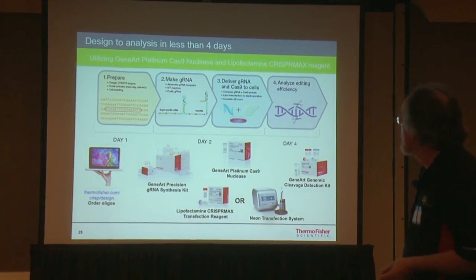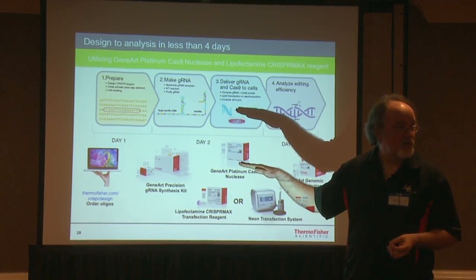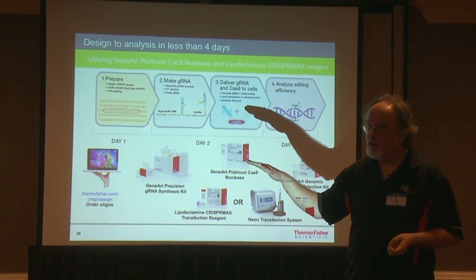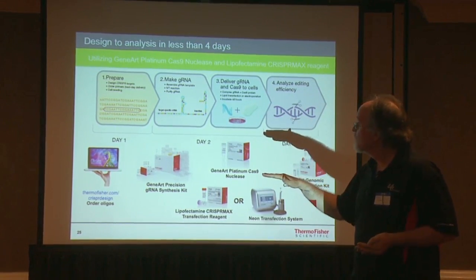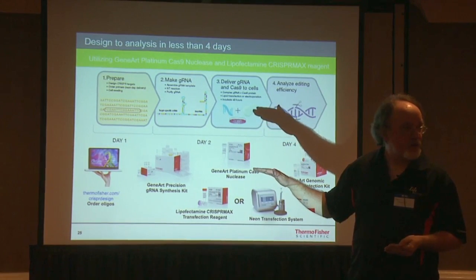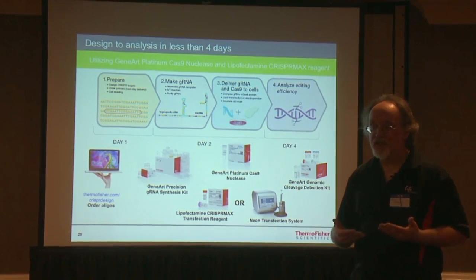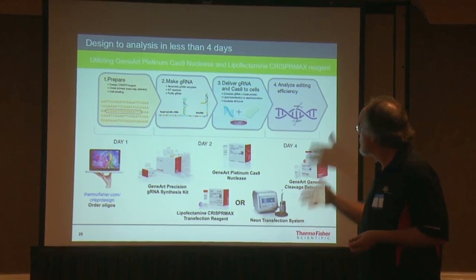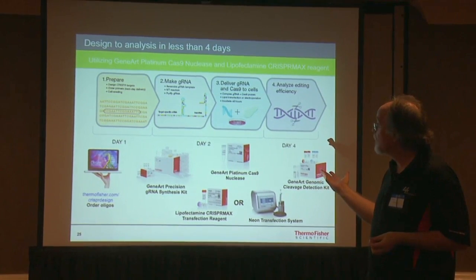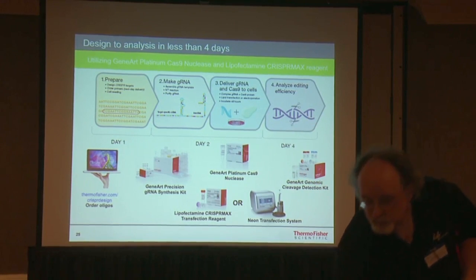So the thing to emphasize is we're using a lot of different software out there. We're using SBOL as a data model around which we are building our tools and reagents. We're standardizing the way in which we do our experiments as much as possible to make it as efficient and easy as possible for somebody to do these kinds of experiments. The result is that we're able to generate a 4-day workflow for engineering an individual cell line.